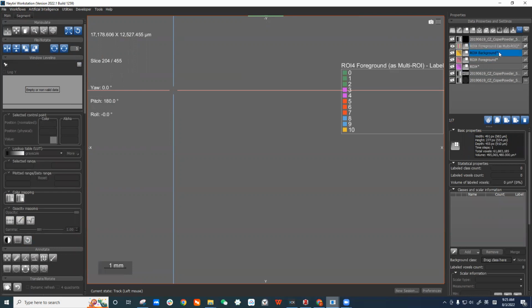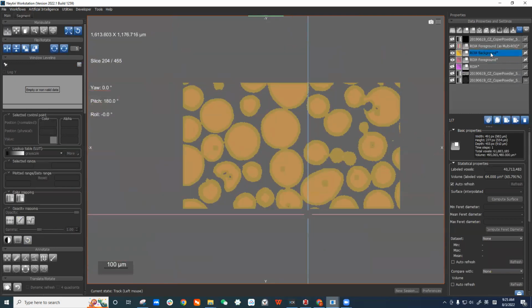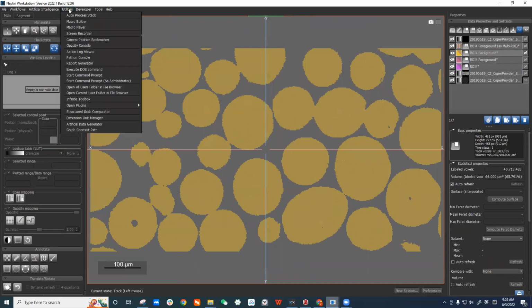The watershed is also wrong. Up to here, I think it is correct, so this and this, the seed. Okay, now I need to find out why my macro has some issue reproducing the Sobel filtered image.